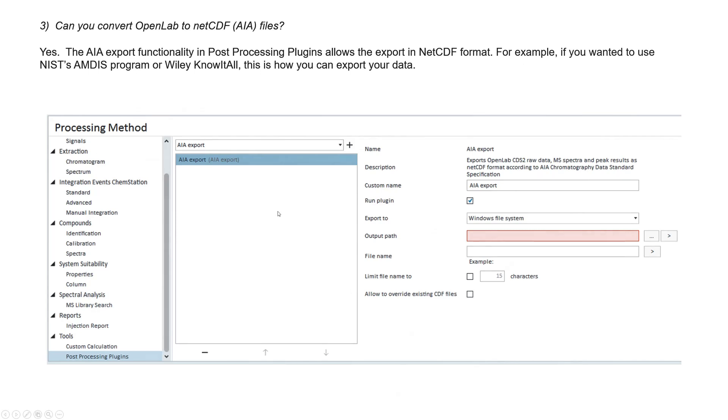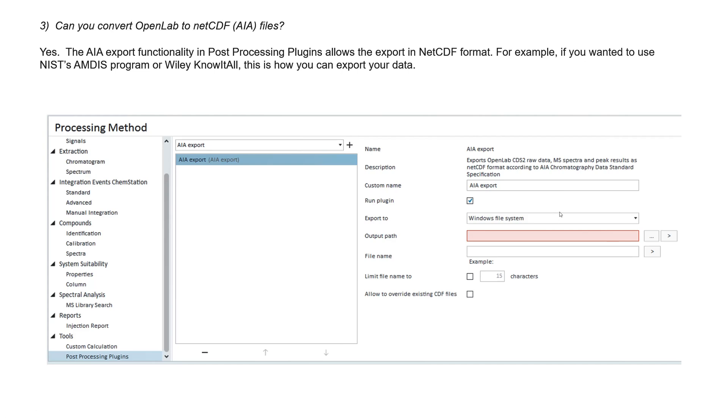Can you convert OpenLab files to NetCDF? Of course, NetCDF is a common data format that all the manufacturers share. And yes, with the plugin, you can do that with these post-processing plugins. And so you just go down, and you have it installed, post-processing plugins down here on the left, and do the conversion. And it comes out as a NetCDF file. And you could open that with Amdus if you wanted to, or I use it with Wiley Know-It-All. You could use it for a lot of different things, or you could even take it and convert it back to another file format for another data system by using their importer of NetCDF.